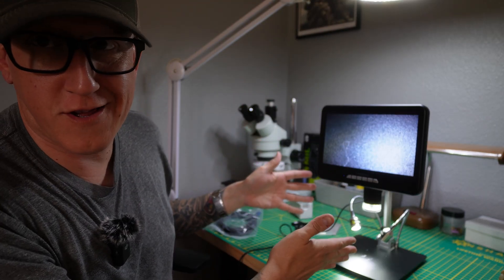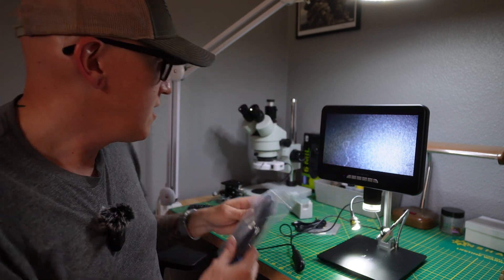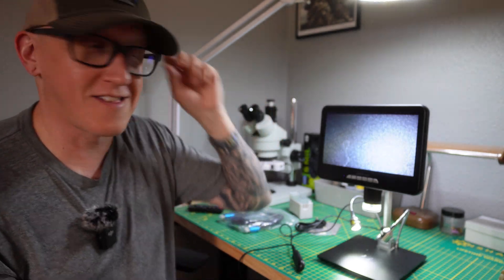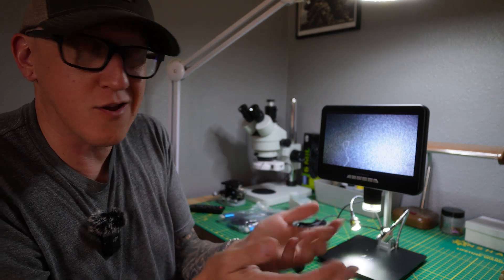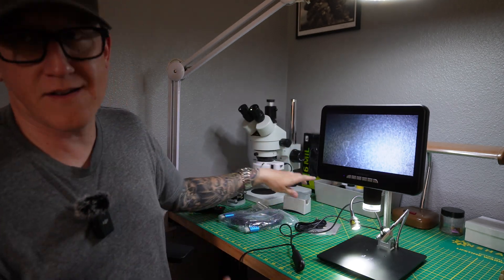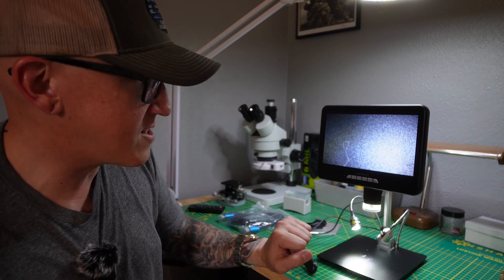This thing comes with other stuff, including an HDMI cable for sending the image out to a monitor or television. Because this screen is not a 4K screen — I don't think you get a 4K screen for $200. It's a 1080p HD screen, which is pretty good, but it's not that crisp image you want. It also comes with things for looking at slides, but for us as amateur mineralogists and mineral recognizers, that's not really that helpful. The dual gooseneck light is pretty nice though.